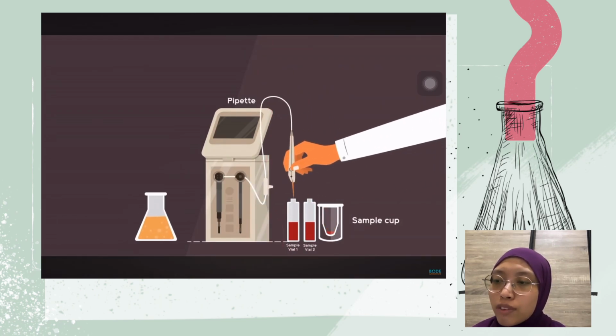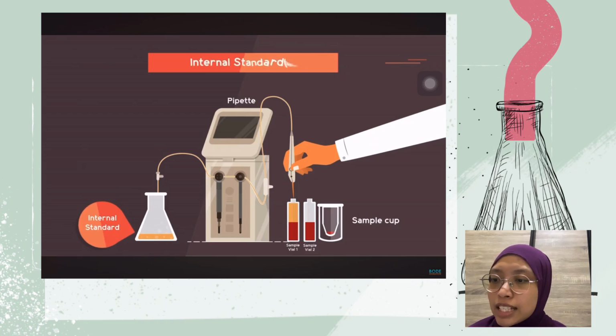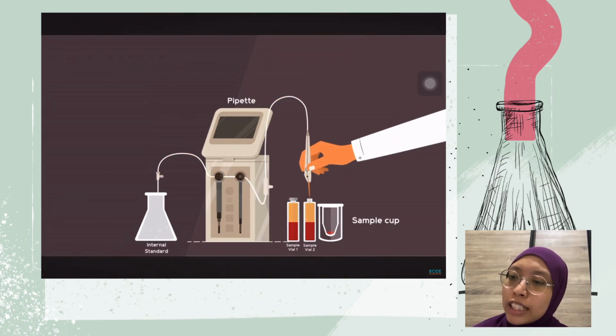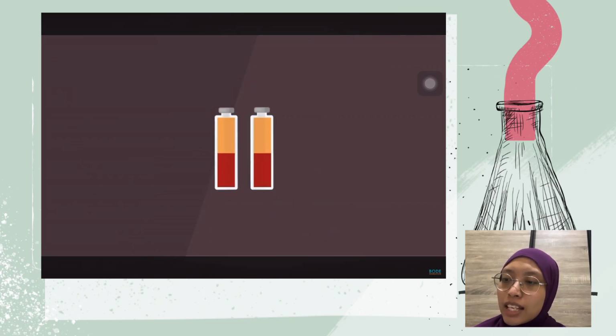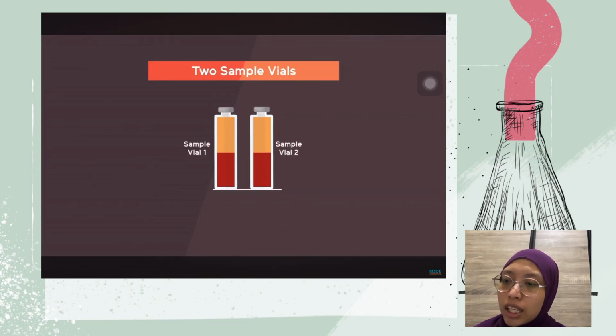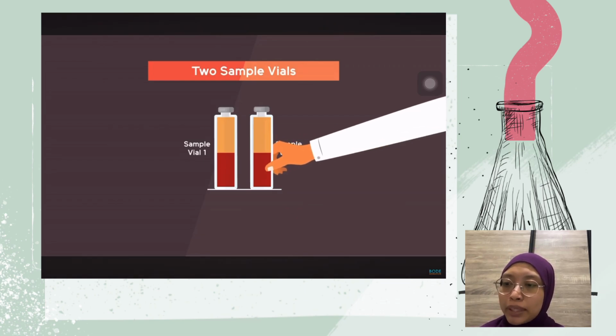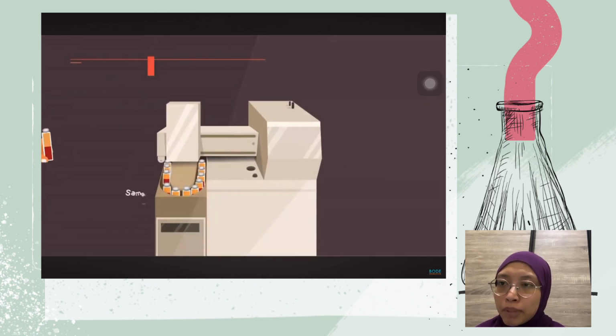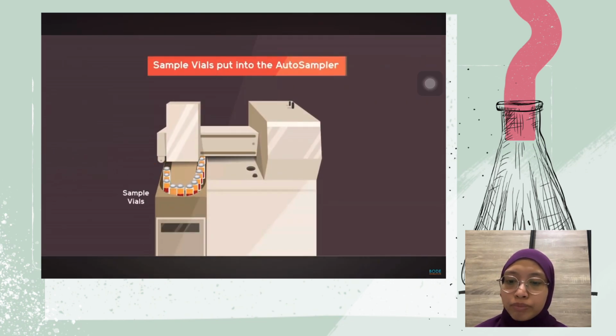Some samples, such as essential oils, are not diluted. Other methods of sample preparation include sample introduction techniques such as thermal desorption and headspace. These are easy techniques as there is typically no or minimal sample preparation.